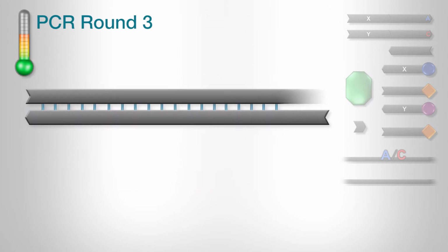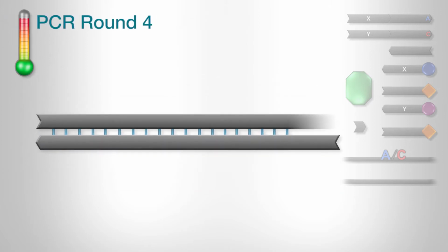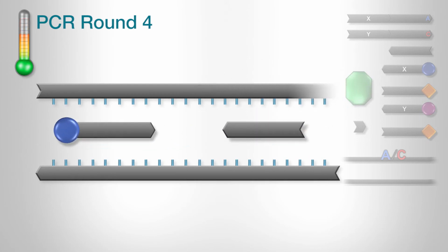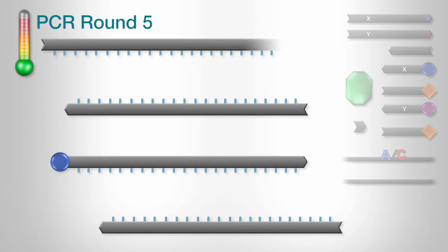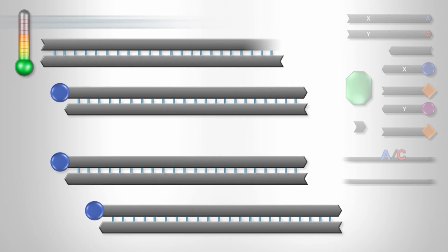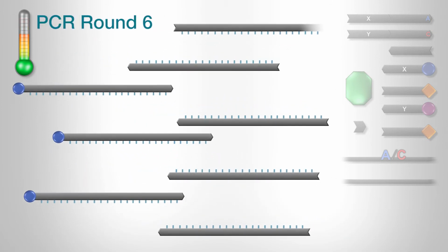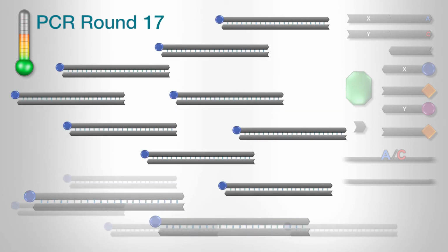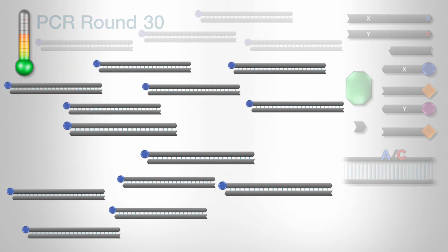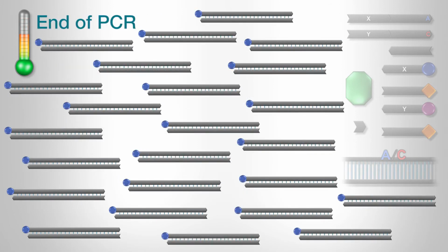As the PCR progresses, with further rounds of denaturation, annealing and extension, the number of PCR products increases exponentially. This results in a greater and greater amount of FAM-labelled oligo becoming incorporated, and subsequently less is quenched in the reporter cassette. KASP is an endpoint genotyping chemistry and should therefore only be read once the PCR reaction is completed.